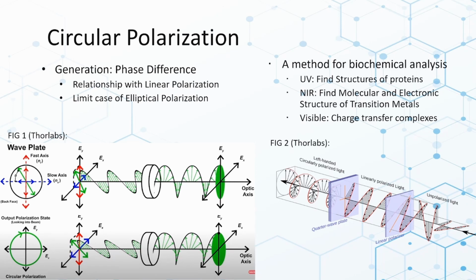When linearly polarized light passes through a quarter wave plate, and the direction of linear polarization is not parallel with the fast axis or slow axis, the electric field vector will have a component in each of the directions of the two axes. Then the two components will have a phase difference of a quarter wavelength. As the components combine, the light rotates.